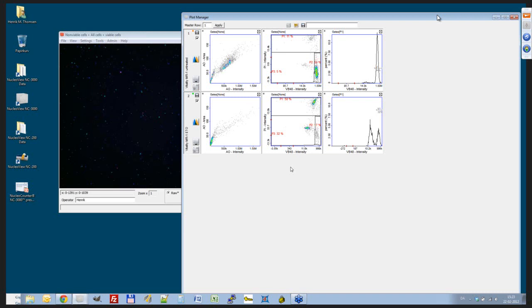And it's a 5-minute assay for measuring early apoptosis or cell health, and used also by production sites to follow their production of cells so that they can see if they are going into a rest or going into a low viability state. And by then measuring this, they can upfront, maybe 2 days in advance, see that the cells are going downhill and need some additives to the media.